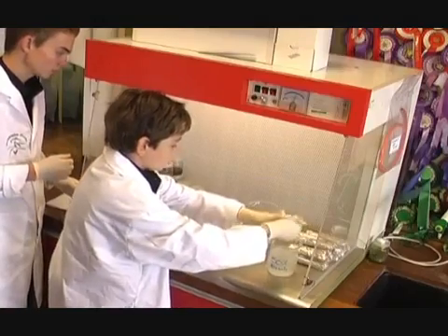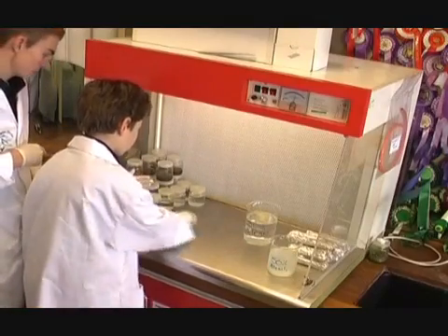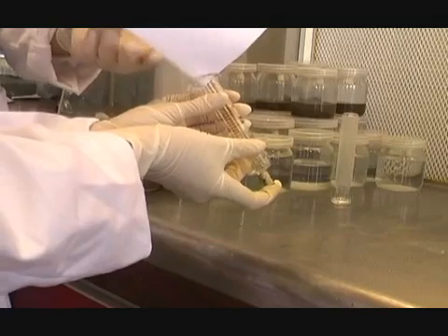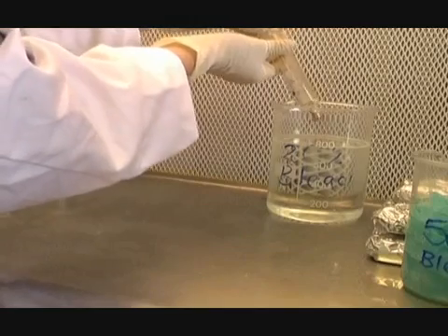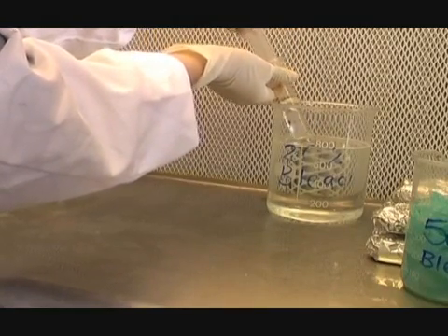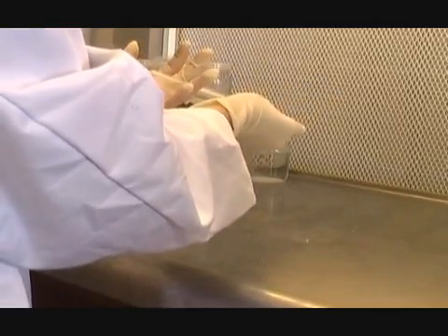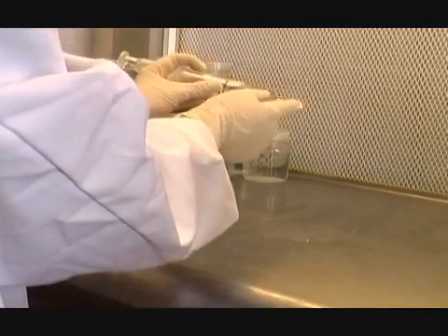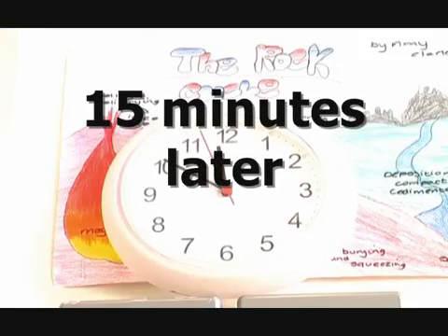They have cleaned the surfaces so that none of the seeds get contaminated with bacteria. Next they put the seeds in a syringe and soak them in 20% bleach solution for 15 minutes. The seeds need to be surface sterilised because just one bacteria or fungus will spoil the seeds. 15 minutes soaking is long enough to kill any bacteria but not long enough to kill the seeds.